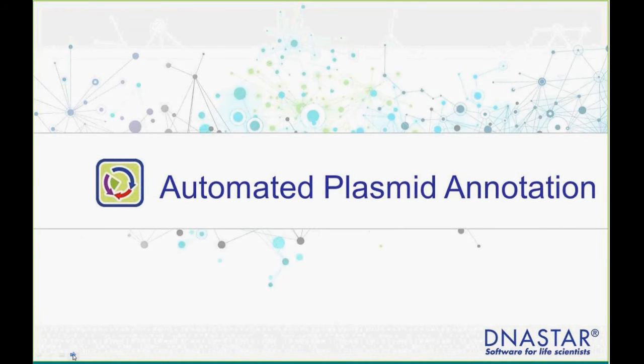So automated plasmid annotation can be as simple as a single plasmid, or it could be a large plasmid with hundreds of features, or it could be a collection of plasmids, dozens or even hundreds of sequences, and it's really meant as a time saver in that we can automate the process. Otherwise, it would be a very manual process of adding annotations one at a time to these sequences. This can streamline and make what's a very tedious job very quick.